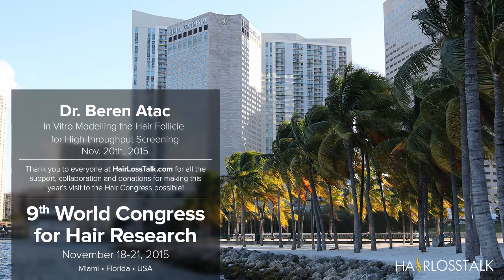In the beginning, until coming to this point, we had what I call bulk cultures. So we had the cells in suspension, and they condensed in the physiological range that they also have in the scalp, a bit smaller, a bit bigger, but in the amount we know, the spheres they produce. But we didn't really know how many cells, for example, were in these organoids. To be able to develop an assay, we need to know how many cells are there. So we came up with the idea, or we were able to develop the system in a way that we have one organoid per well, and we know exactly how many cells are in these organoids, and the ratio and everything.